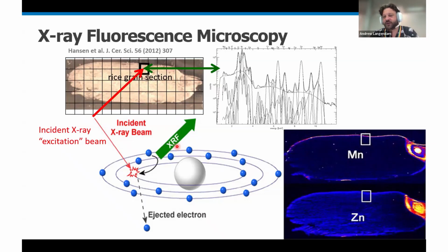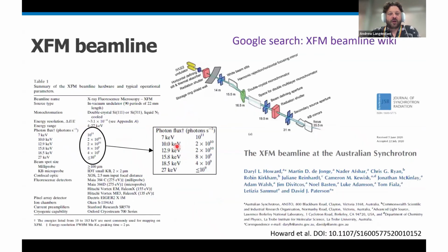This is a rice grain. This was a study that was looking at increasing nutrient content within rice by the Grain Research and Development Corporation. And yeah, they did some very good work, and they regularly come here. Some more figures and maths.